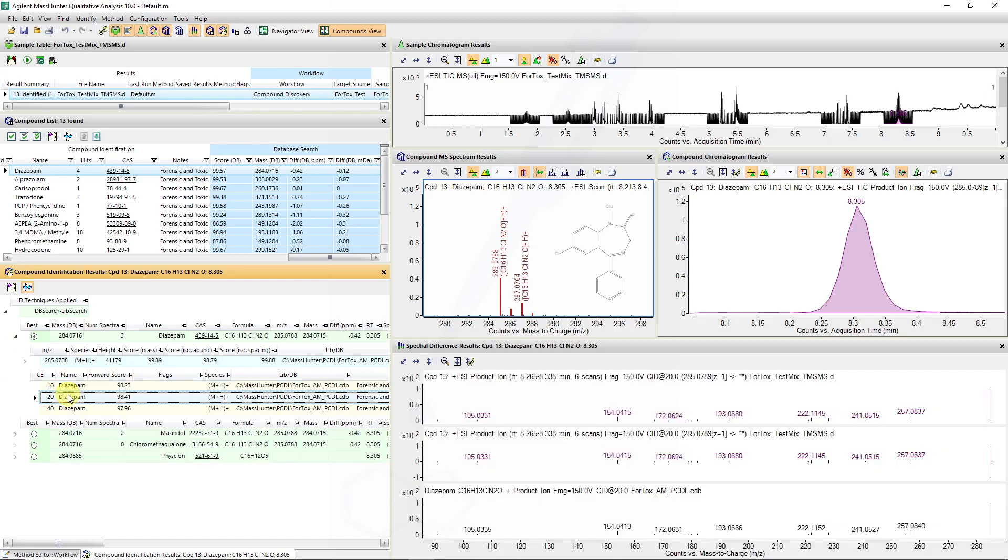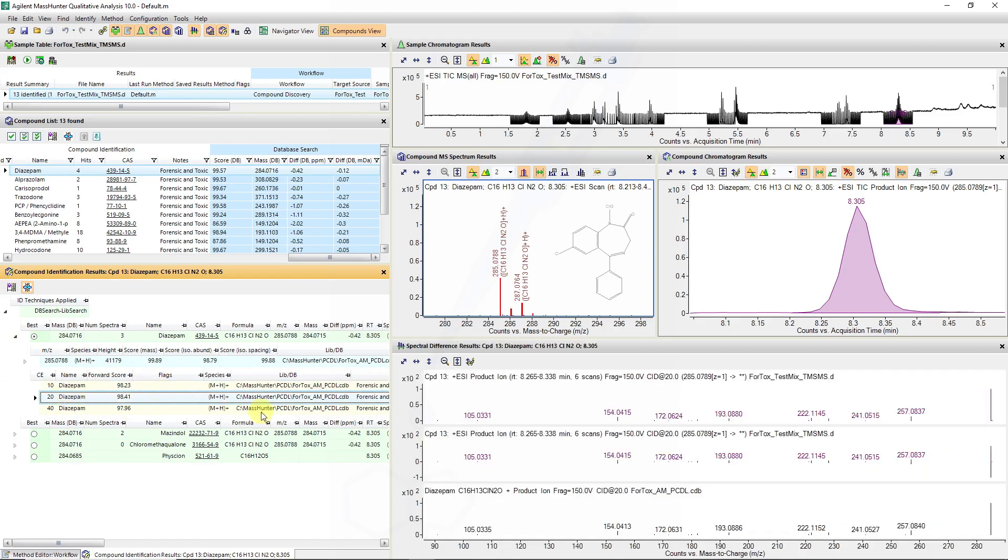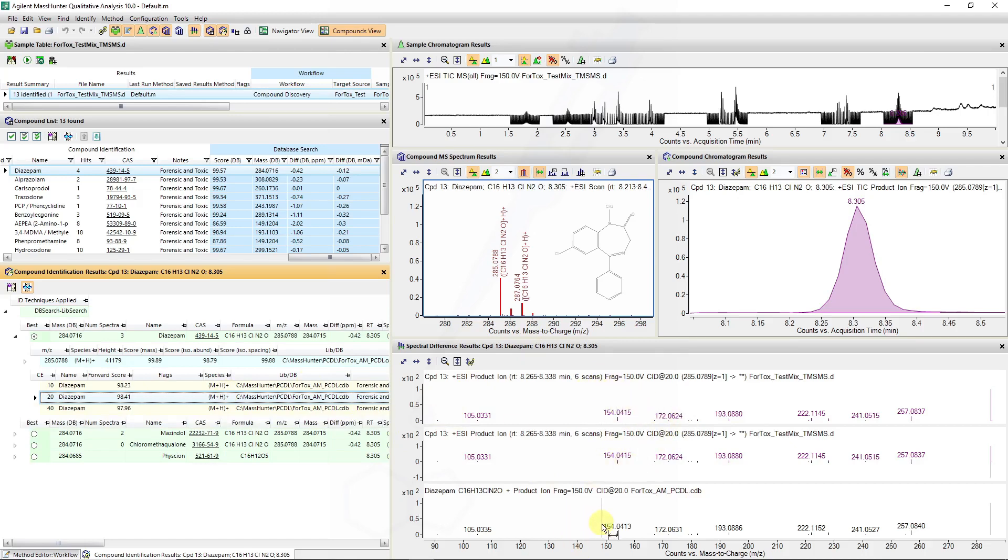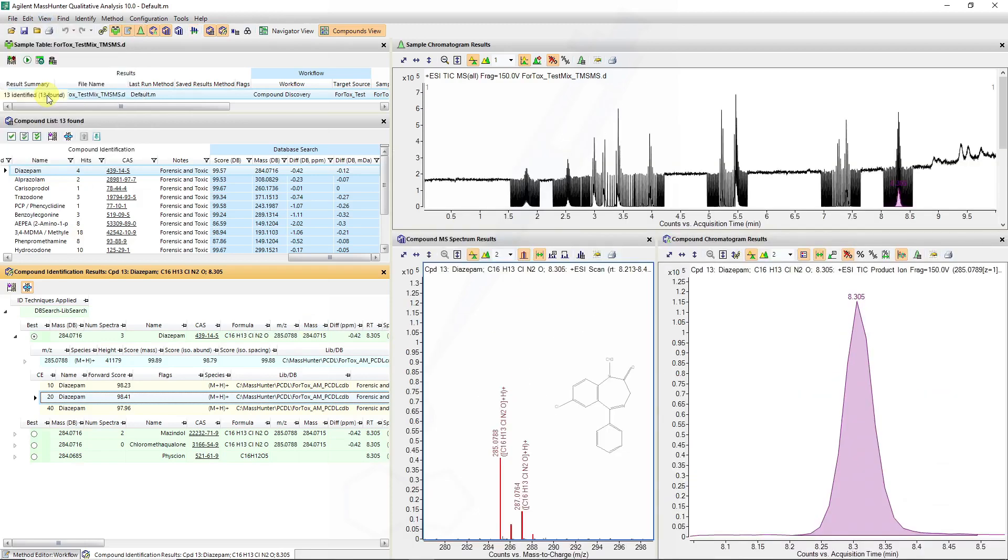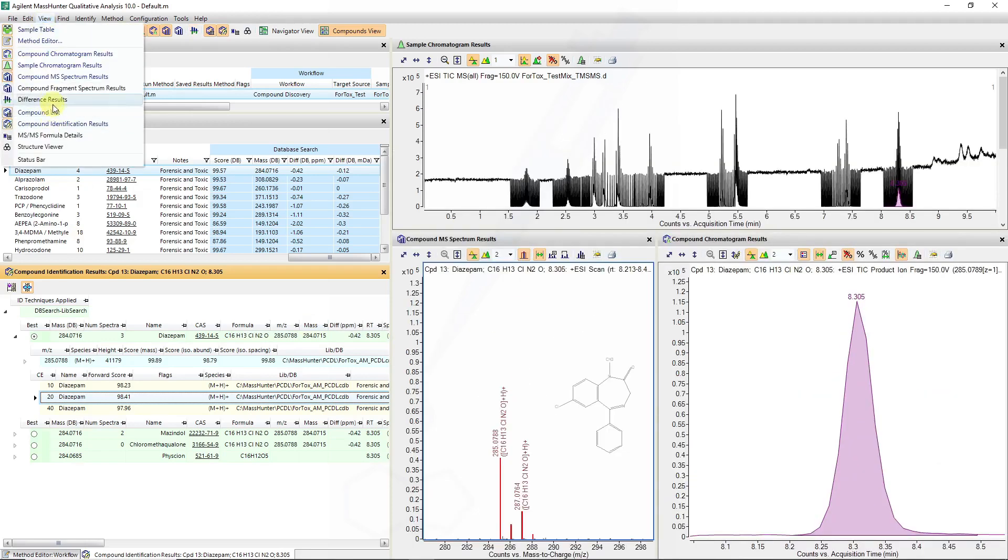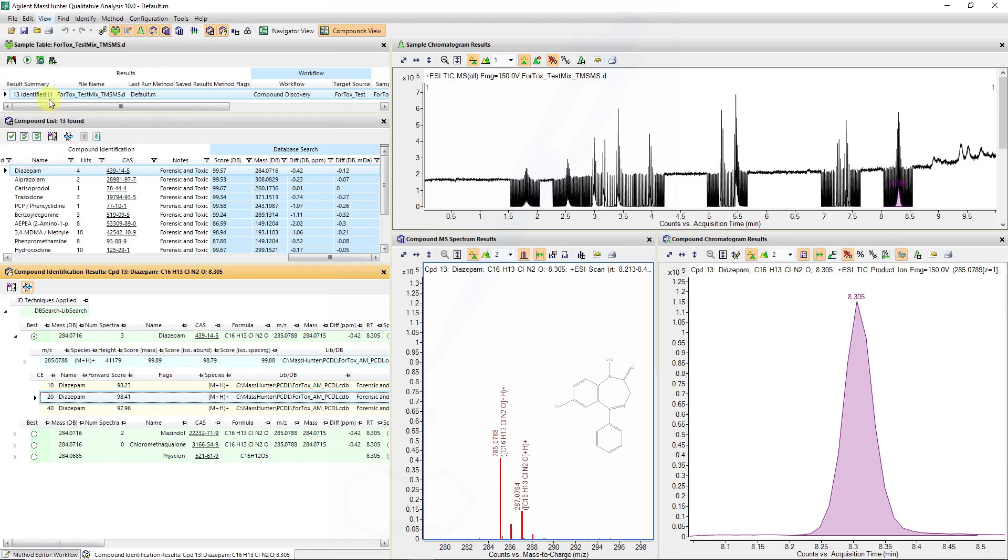If we click on each one of these we can also see the spectral difference plot result which is essentially the sample versus the library entry in a mirror style plot. I will show you how to toggle that as well in the difference results. You can toggle that view if it's not being displayed.